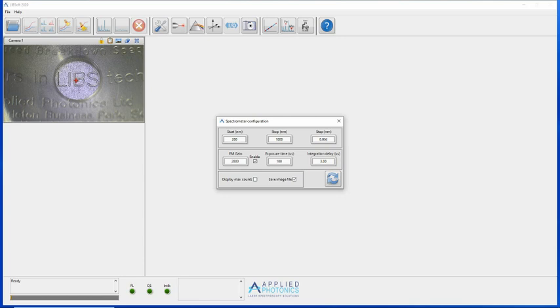For the EMU spectrometer, this delay is introduced by a separate delay generator. This is usually a Quantum Composer's 9200 series device that is shipped with APL systems that use the EMU spectrometer. Libsoft communicates directly with this device to set the delay, and therefore this delay generator must be specified in the initial Libsoft system configuration window and then successfully initialized by the application. If it isn't, the integration delay parameter will be disabled and grayed out.